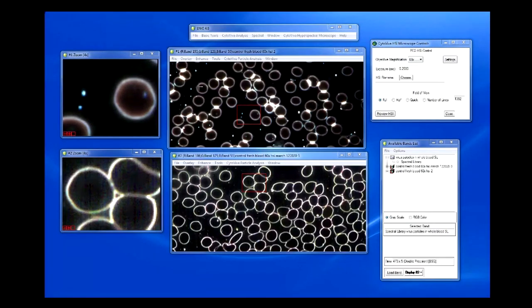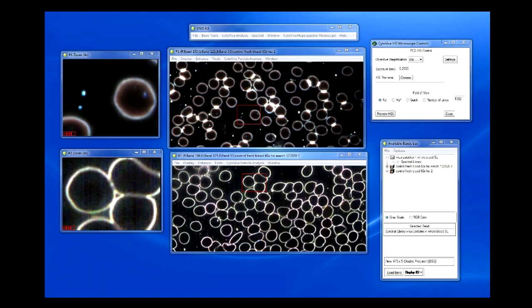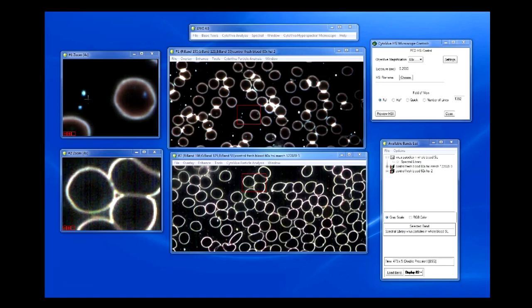The image you see here shows two images. This is a live blood cell sample from a subject who had a very severe upper respiratory virus infection, and this is the very same subject about a month later once they were symptom-free. We're not sure exactly what type of virus we were looking at — the point is just to demonstrate what you can observe when virus particles are present. You'll notice the scatter from these bluish particles mostly in the plasma of the whole blood sample.